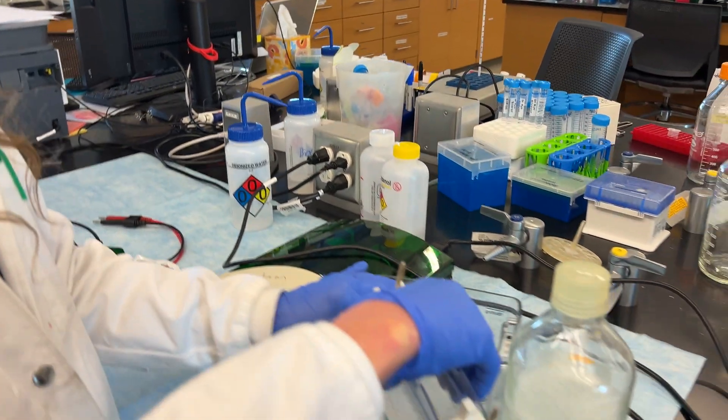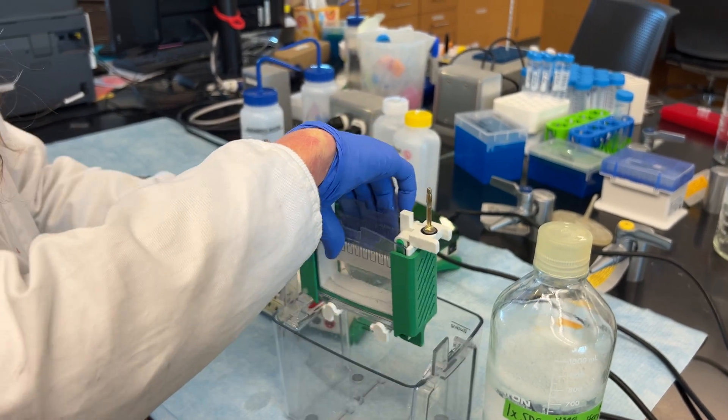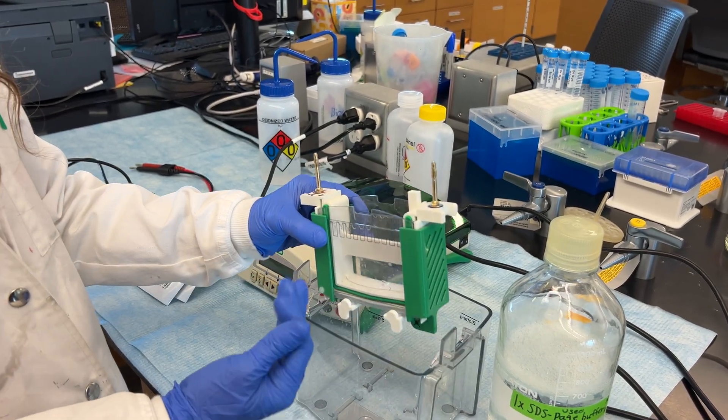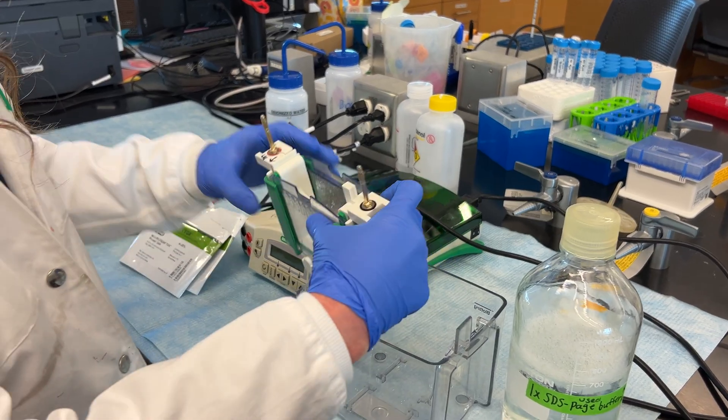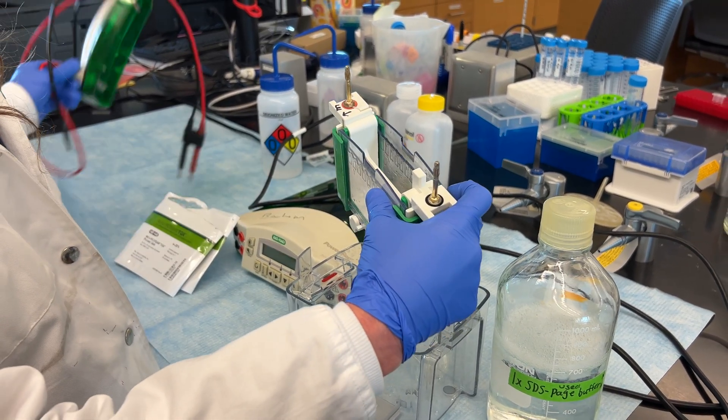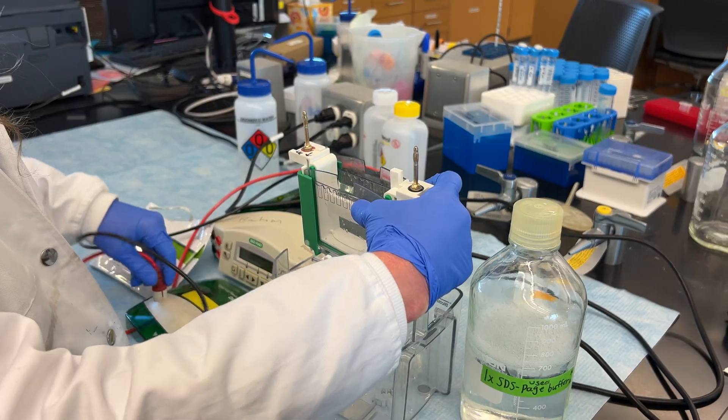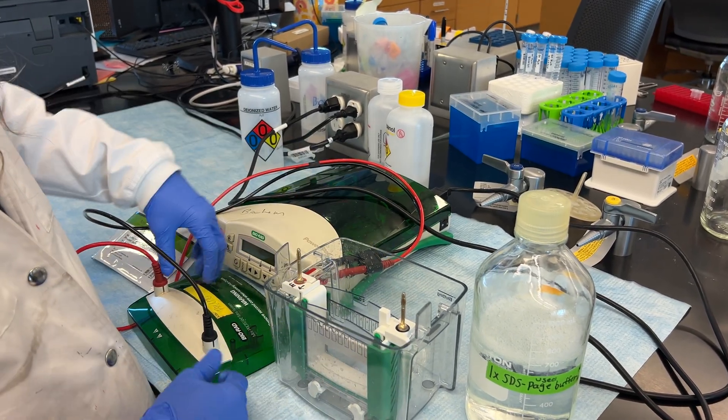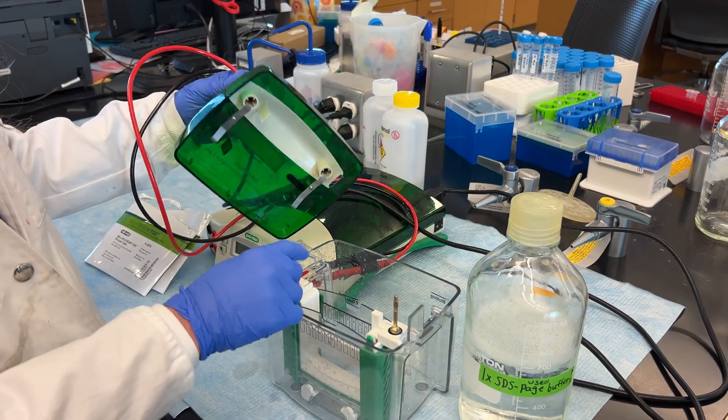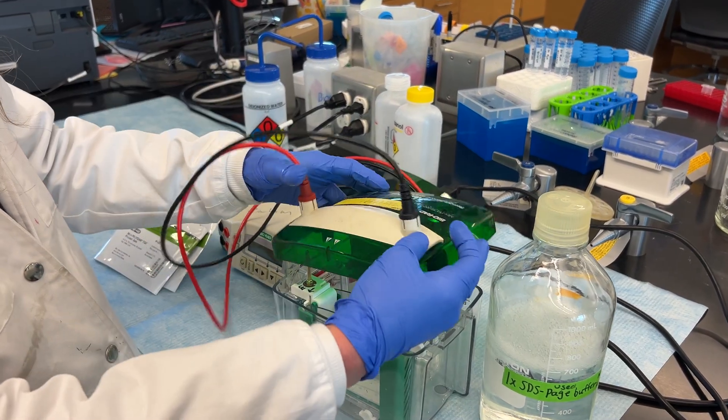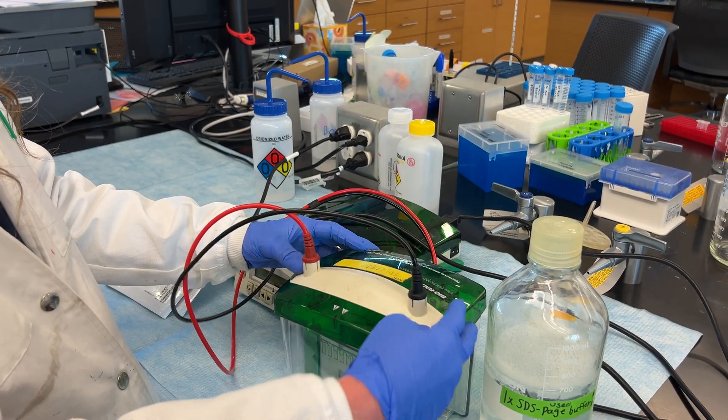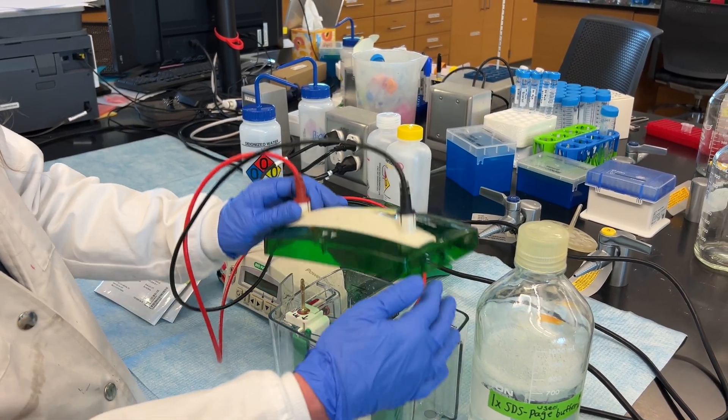When you stick it in your box, you want to make sure that you're sticking it in the way that's going to be most convenient for you to load. And so you should strategize beforehand so that when the box is in, you want to make sure the red is to the red and the black is to the black. And then these electrodes are going to need to be in contact with these. So you want to make sure that you're going to have your gel in the right orientation.